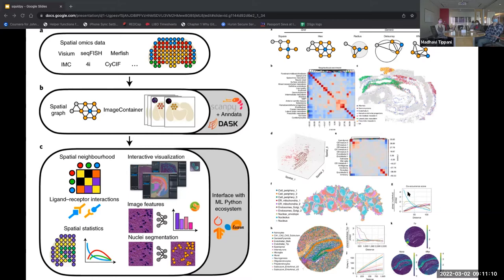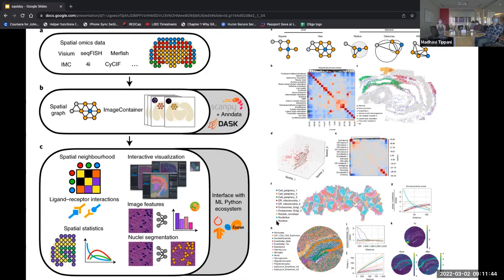They have a co-occurrence score analysis module, and using that they found that the nucleolus cluster is highly co-occurring with the nucleus and the nuclear envelope clusters. The blue line here is the nucleolus, and when they perform the co-occurrence analysis on that cluster they see these two other clusters co-occurring with it among all other cell types.